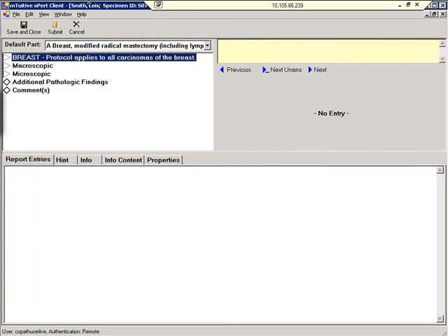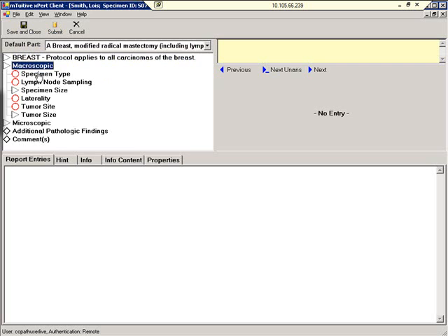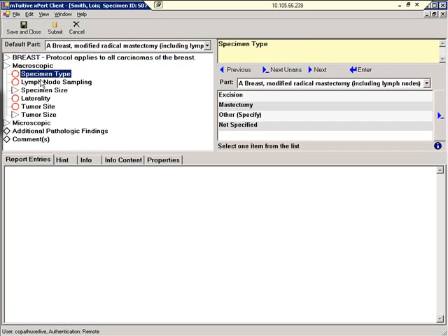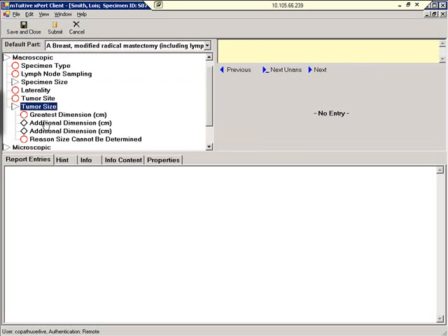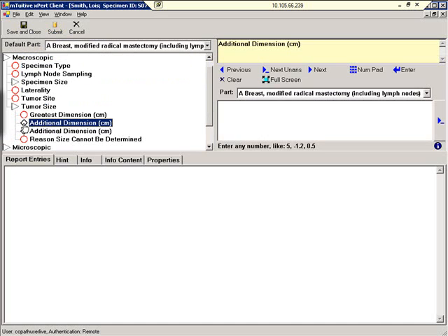Before we get started, let's take a moment to familiarize ourselves with the intuitive user interface. In the upper left-hand corner of the screen, we have a navigation tree. This is a visual representation of the CAP checklist. Required fields are designated with a red circle, while fields that are not required are designated with a black diamond.